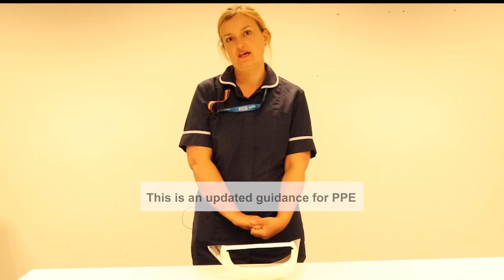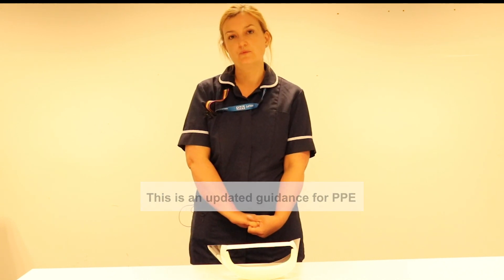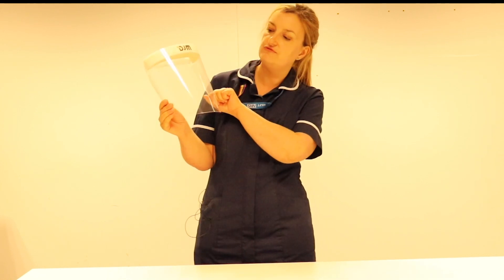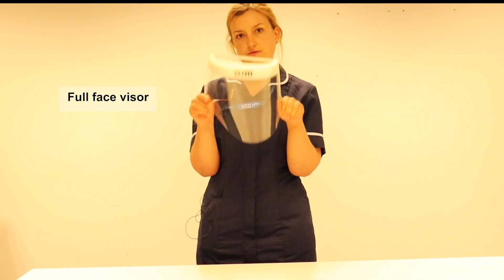The film you're about to see is about the donning and doffing during an AGP procedure. In this film you will see that Catherine is wearing small goggles as eye protection. These are no longer being used in NELF. We are now using the full face visors such as these. These are disposed of in the same way as they are during the film.